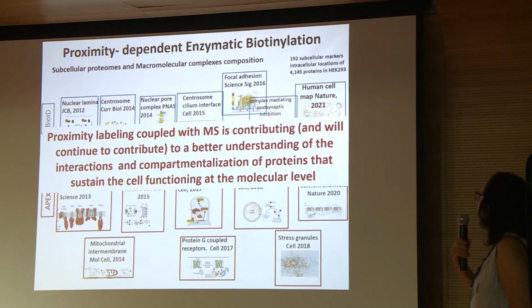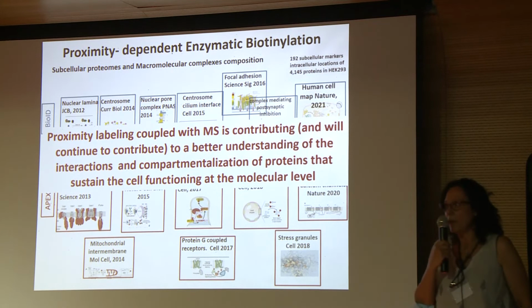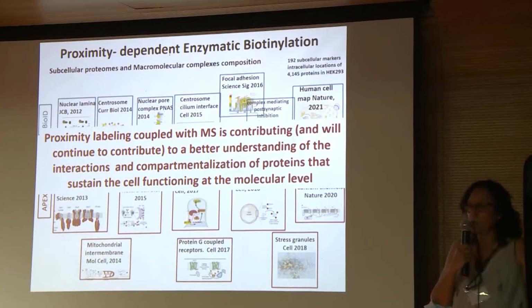And I hope that I could show you that proximity labeling coupled to MS has contributed, and for sure will continue to contribute, because there are many enzymes being developed, to a better understanding of the interactions and compartmentalization of proteins that sustain the functioning of the cell at the molecular level. And the last thing I would like to say is that I'm talking about enzymatic biotinylation, but there are other ways to perform proximity labeling that are not based on biotin, that introduce other labels, and they are also useful. These are the most studied and the most common. That's why I focus on this one.